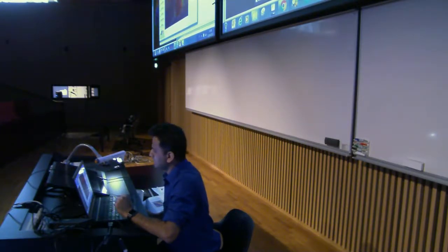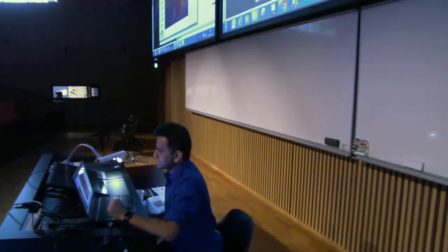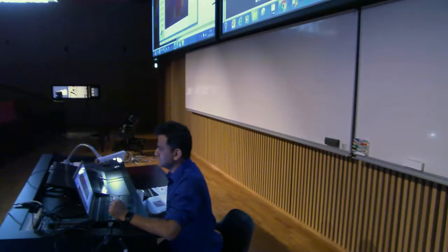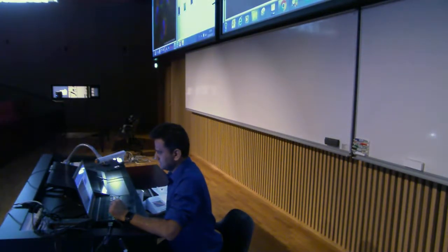So you can have multiple ROIs belonging to one class, right? Class 1, vector class, likewise, okay, and then it will be more accurate. Okay, you can save this classifier and then apply it to the other one. That's possible.